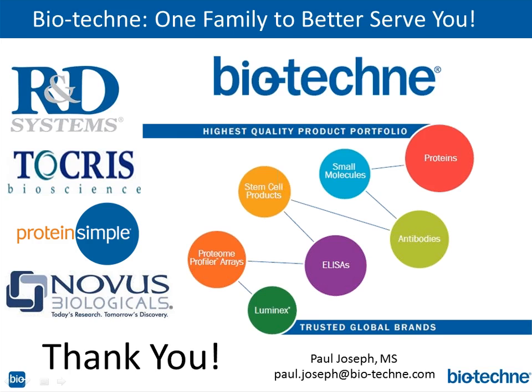So if you're looking for something that's really large or most distant from that size, I might want to just make sure that I got good transfer of that size. Because, like I said, not all proteins are created equal when it comes to transfer efficiency or elution efficiency and then binding efficiency. Hopefully that answers it. No, that makes perfect sense to me.